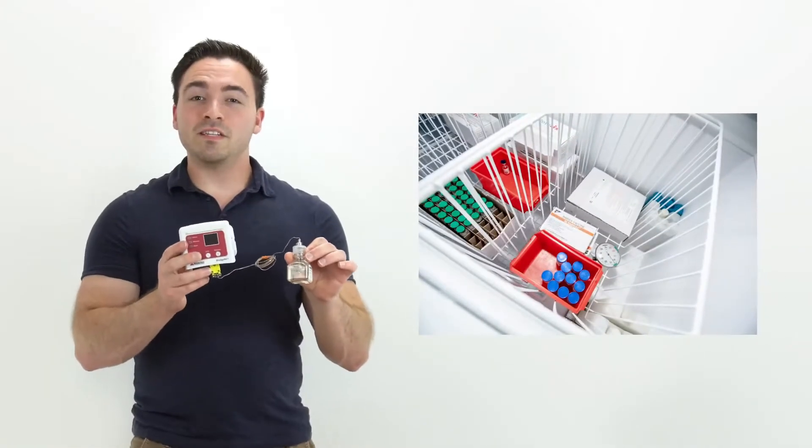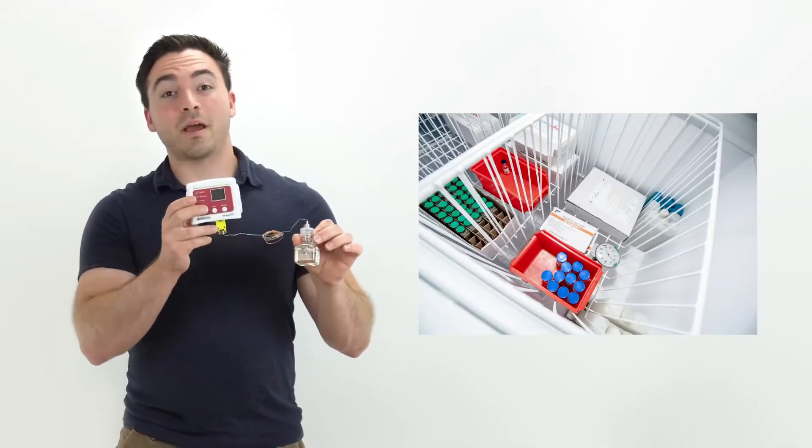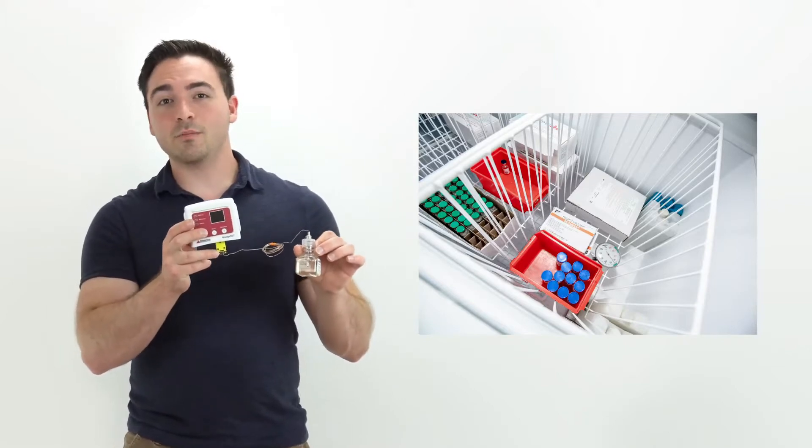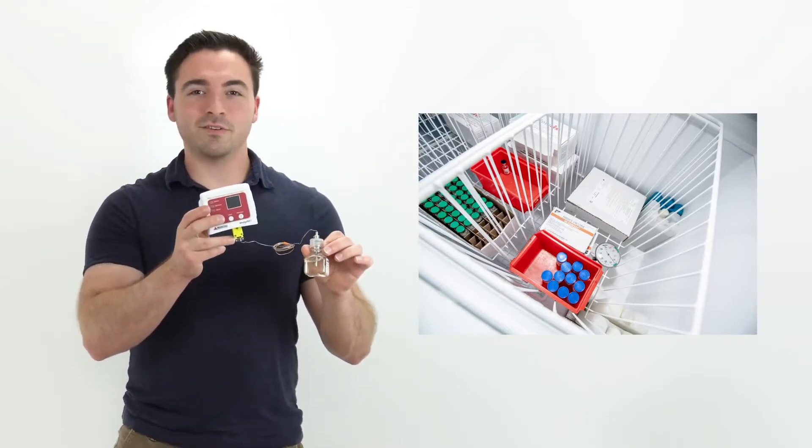The VTMS is specifically designed to wirelessly and continuously monitor temperature sensitive vaccines and pharmaceuticals in refrigerators, coolers and freezers.